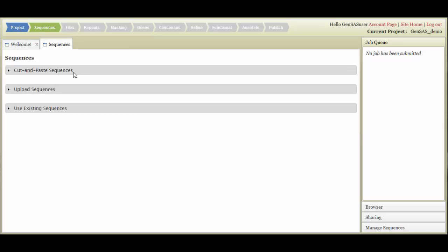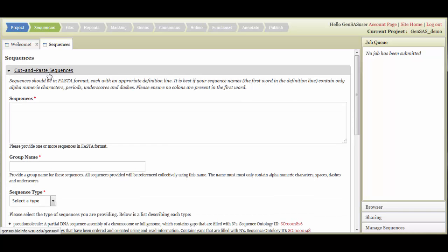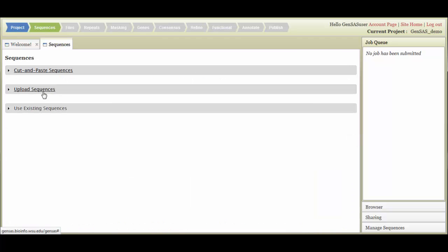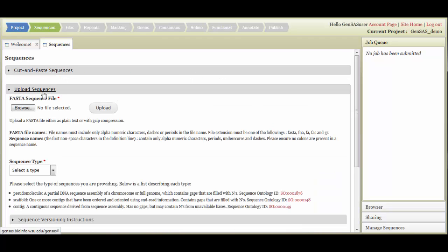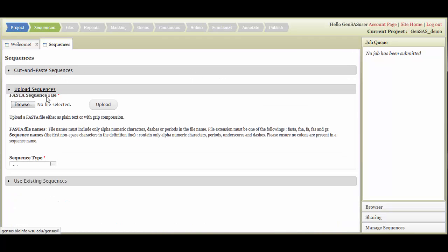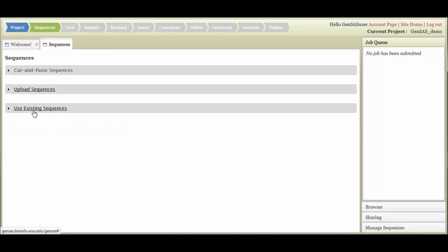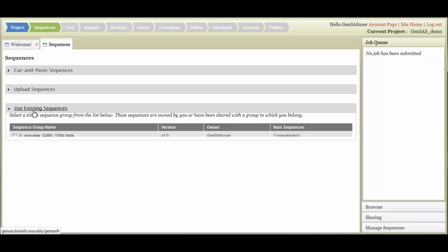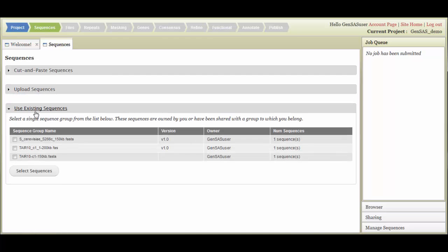Once the project has been created, the Sequences tab will change color and be available for use. There are two ways to upload sequences into GenSaaS. For new sequences, you can either cut and paste FASTA formatted sequences into the text box, or you can upload FASTA files.